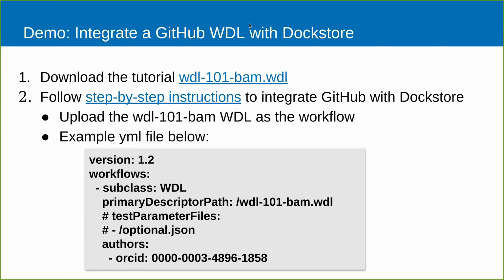I have a quick question for you. Yesterday I was working through the homework to get the WDL working on Terra. It crashed because it couldn't get SAMtools to work.